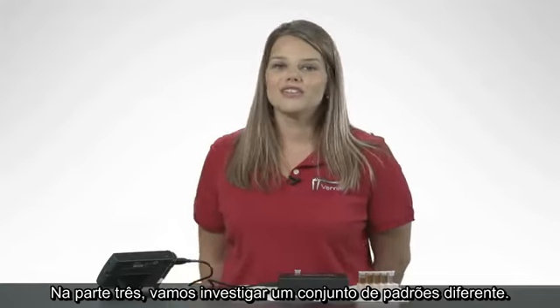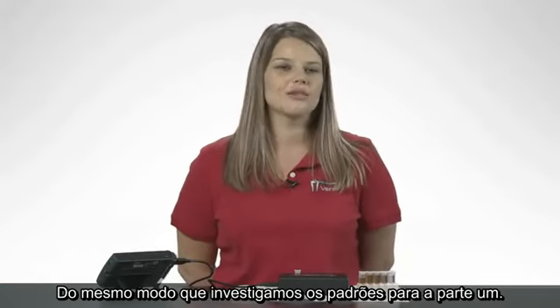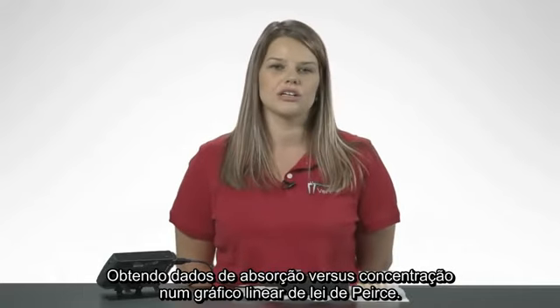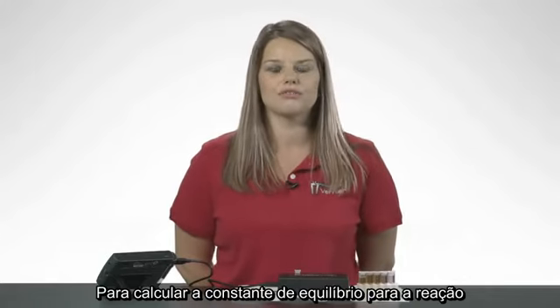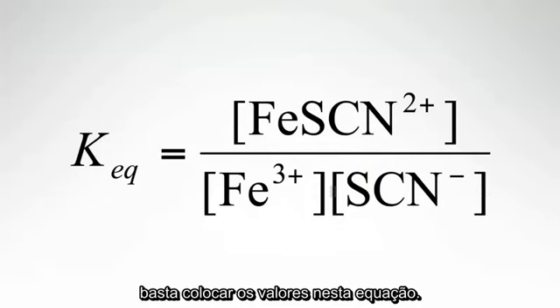In part 3, you're going to investigate a different set of standards, just like we investigated the standards for part 1, where you get absorbance data versus concentration in a Beer's Law linear graph. To then calculate the equilibrium constant for the reaction, you plug your values into this equation.